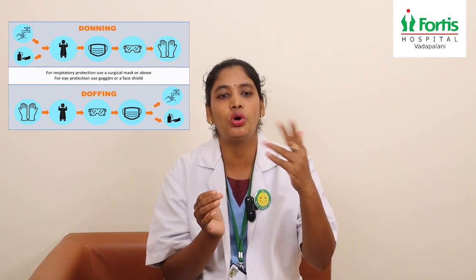According to the CDC, we can see here the sequence of the PPE: hand wash, gown, mask, face shield and hand sanitizer, and then the gloves. After using the gloves, you should not go away to any part other than the patient care area and the sterile things.